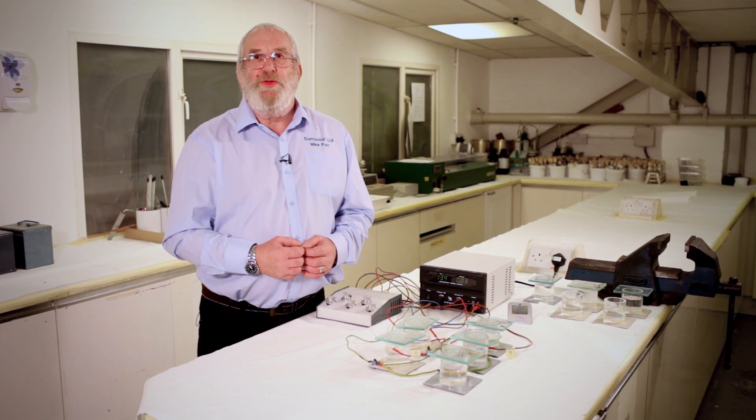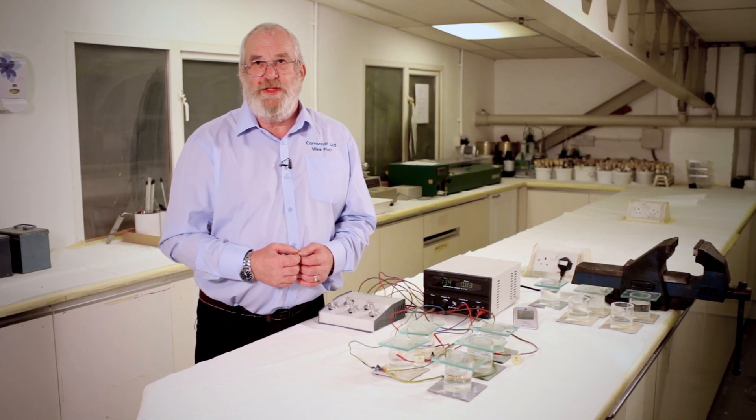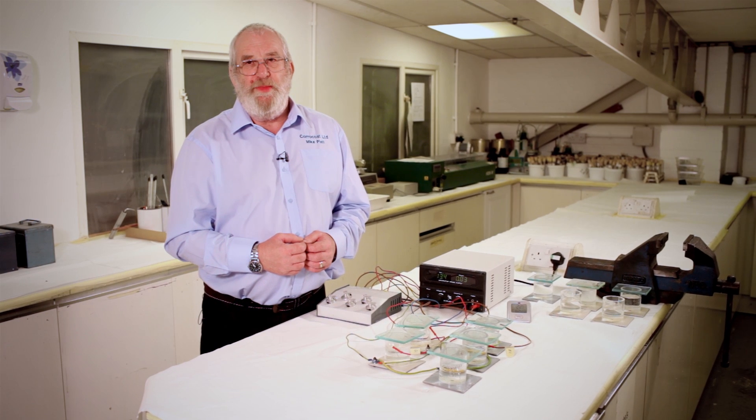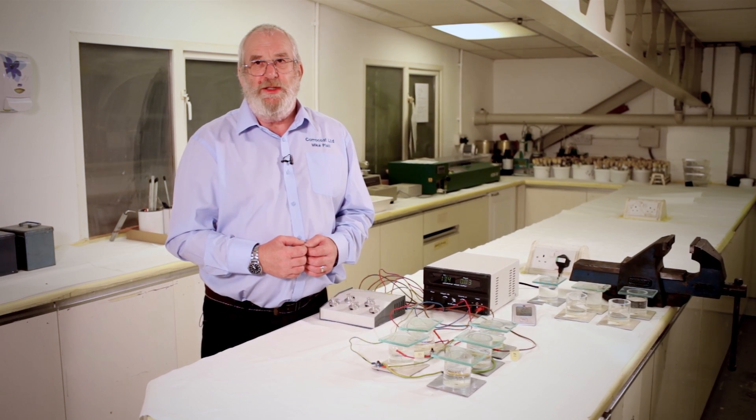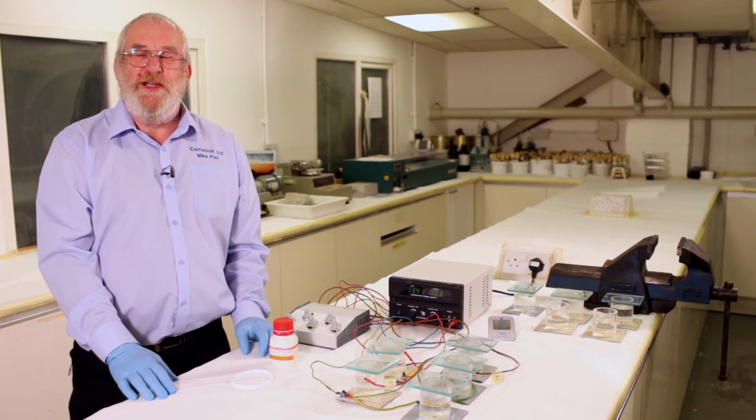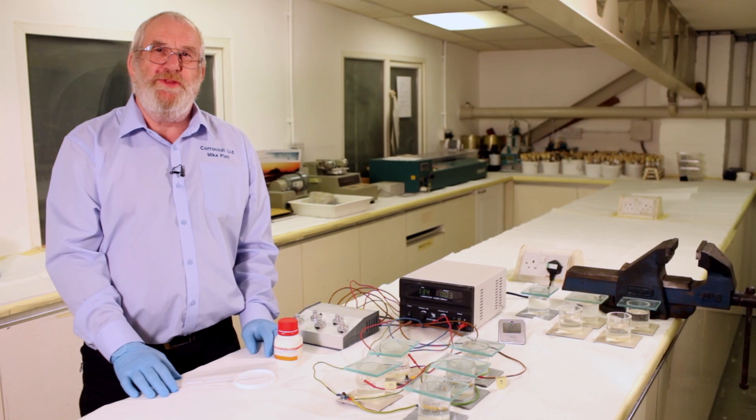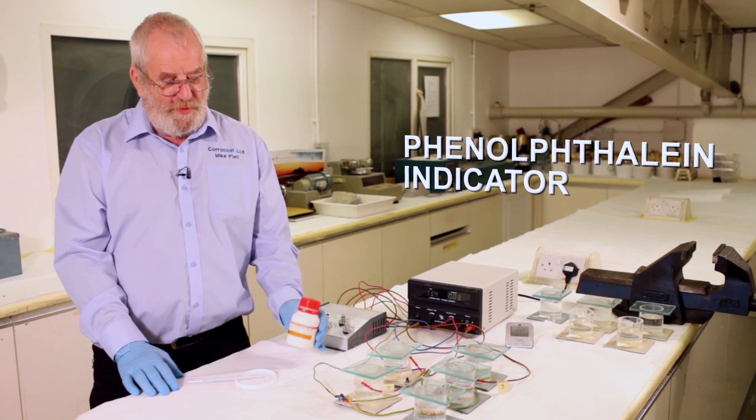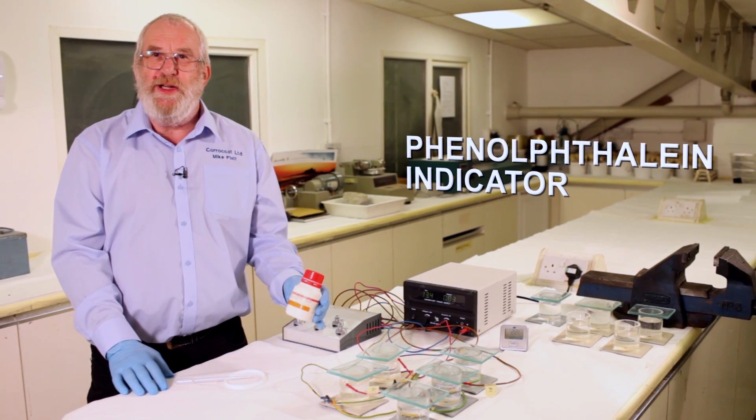There are some issues in assessing the end results. Whether the coating is a thick or thin film, elastomeric, rigid or brittle, the exact area of disbondment can be difficult to measure. To assess the area of disbondment, it is preferable to use a marker. The one we use at Coracoat is phenolphthalein.